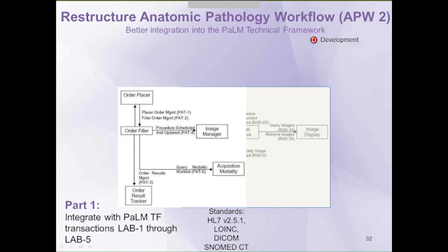And so what's been done is to leverage the transactions that have been documented in the PaLM technical framework, specifically the transactions Lab 1 through Lab 5, and kind of overlay them onto the work and effort that's gone into development of transactions in the radiology domain.